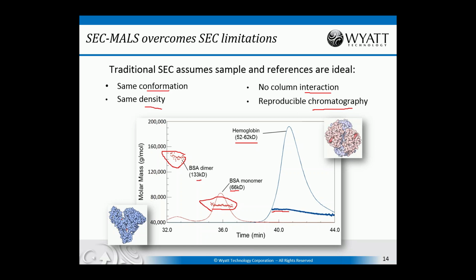So at 62 kilodaltons, we're essentially looking at a tetramer, but due to dissociation during the dilution on the column, there is actually an equilibrium between tetramers and dimers, and we can see that in the molecular weight as measured by light scattering decreasing across the peak, giving us this funny shoulder on the trailing edge. Without light scattering, we would not actually know what's going on in terms of the shoulder. Light scattering tells us the molecular weight decreases, and that's a sure indicator of this equilibrium.